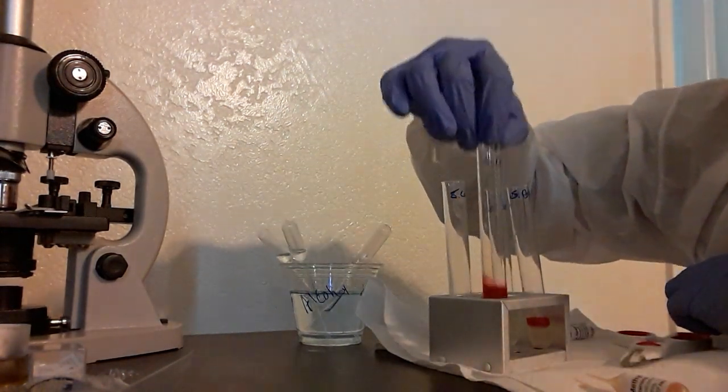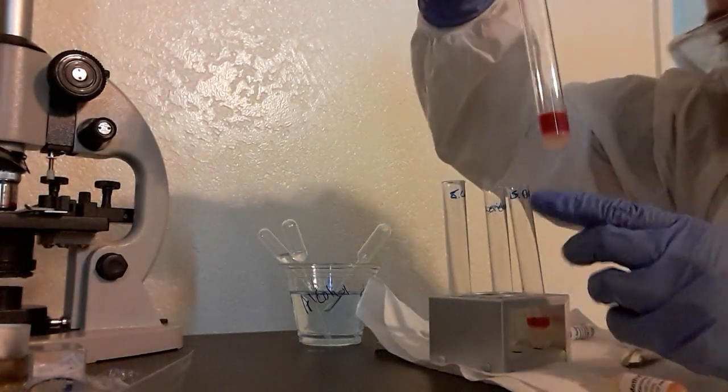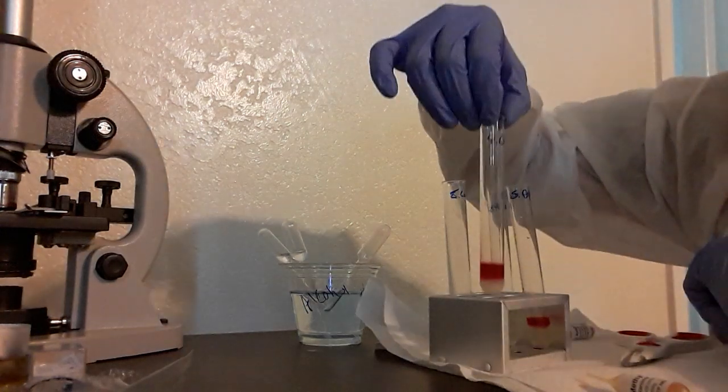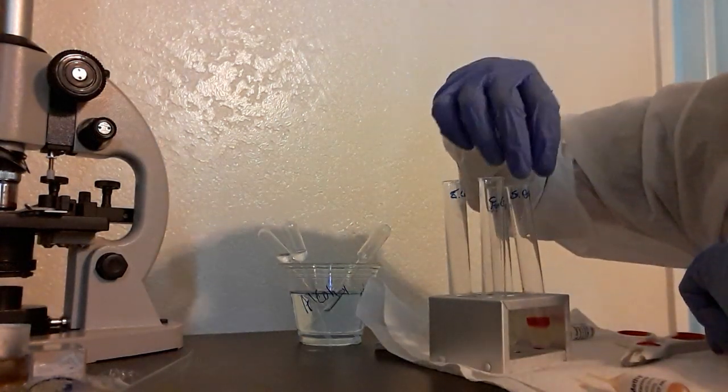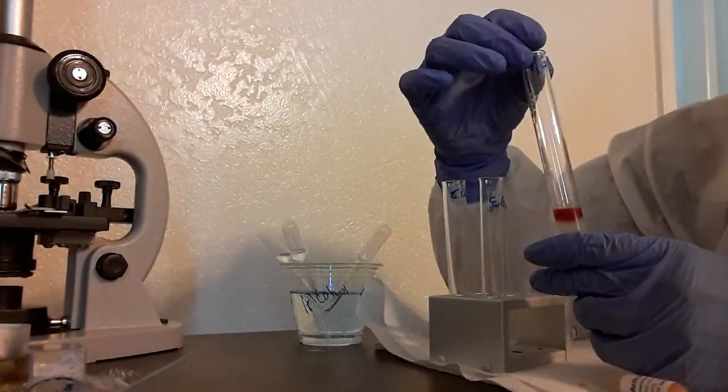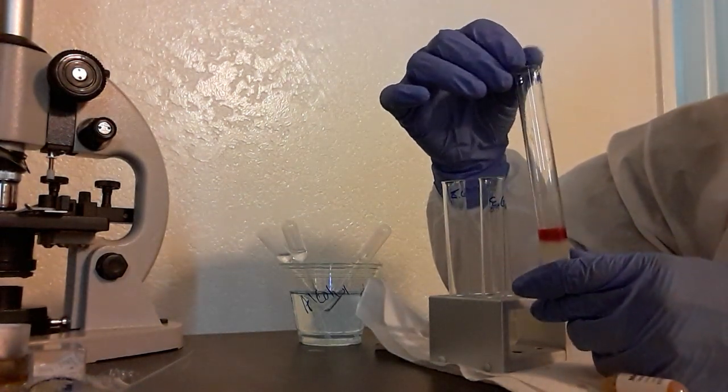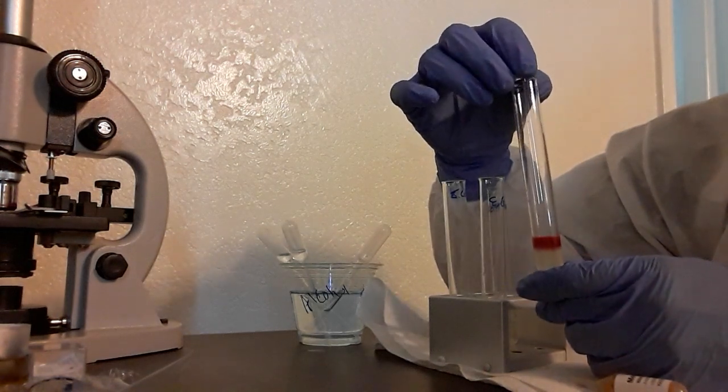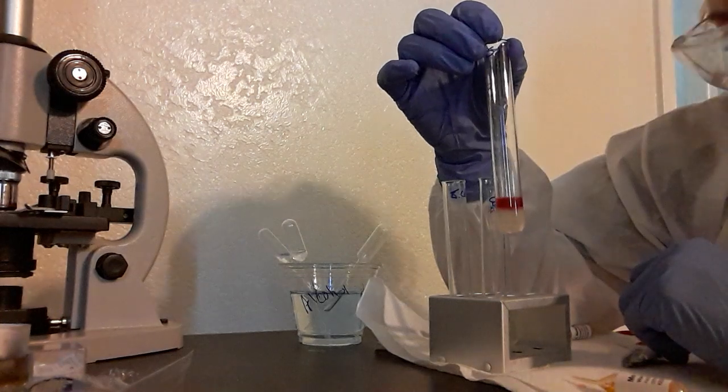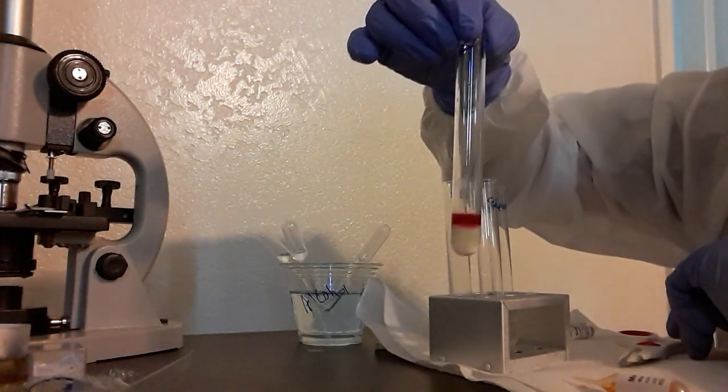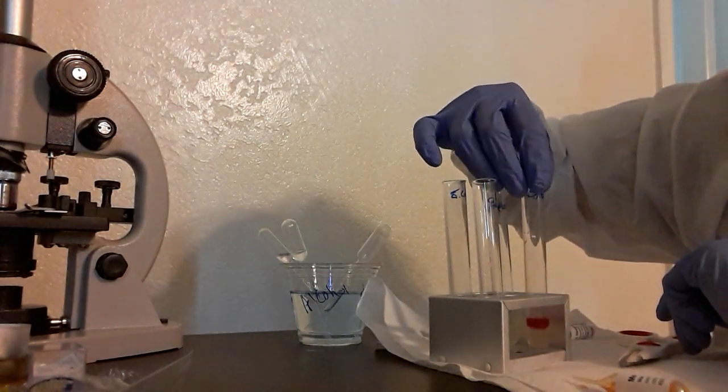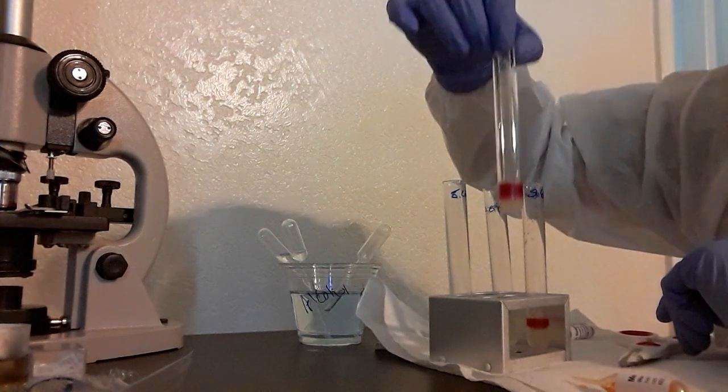If you look, they're both red. The E. coli is really taking in the red color a lot faster, so that is a positive result. The red's just sitting on top for the epidermidis, so it's not mixing well at all, but it would look like a positive result to me on that one. Alright, so both microbes are mixed acid fermentation.